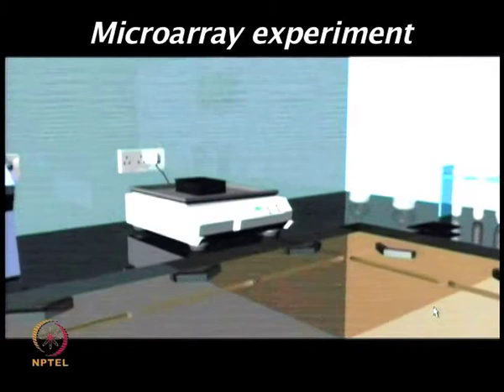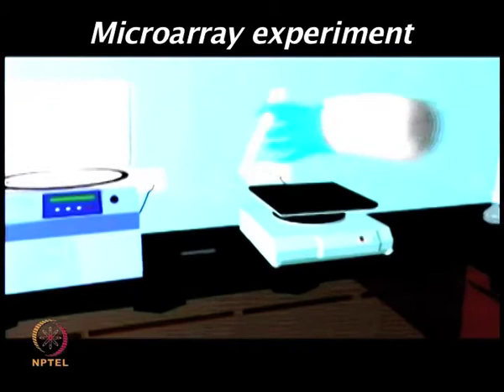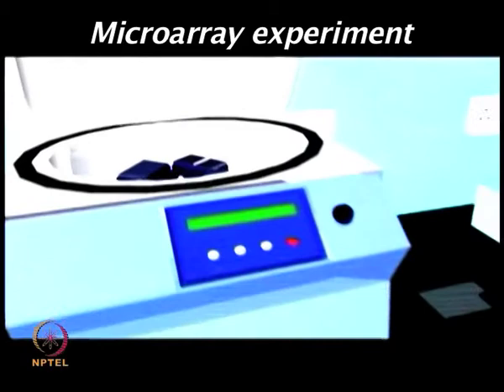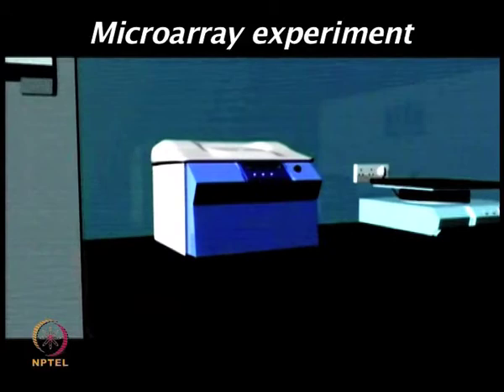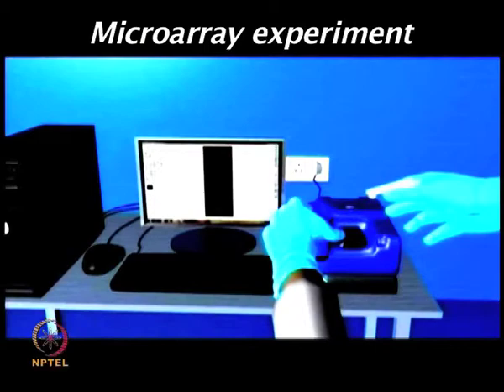After this washing step, it is important to remove any liquid adhered on the chip surface. One can use a centrifuge to remove this liquid, or one can use compressed air to dry the slides. You have to ensure the right type of rotors while centrifuging the chips. Once the drying process is completed, the chips can be scanned using scanners and selecting the appropriate wavelength.